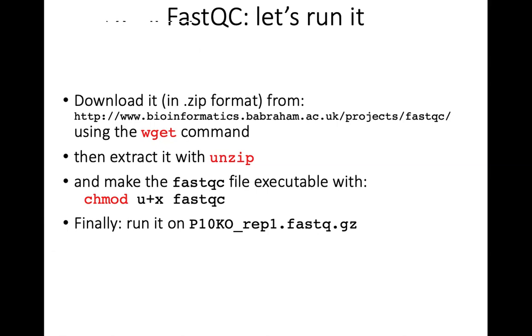Oh, that's different. That's just because it's trying to download the file to your current directory, and you're still in my scratch directory, which you don't have permission to write to because they're my directories. Everyone can only write to their own directories in general. So it's telling you you're trying to create a new file in this directory, but you don't have permission to write. That is right. So just change your directory to your own scratch.